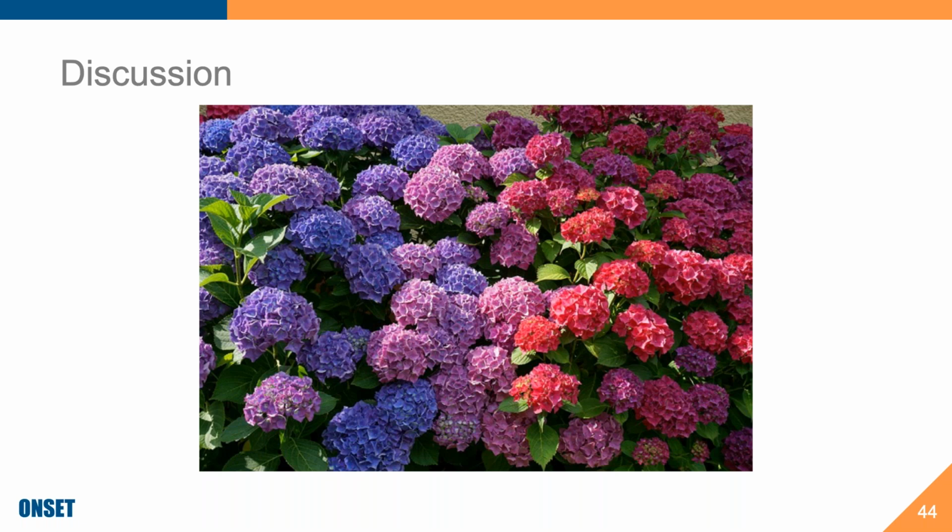What is your typical logging interval? Mine currently is at a 5-minute interval. The benefit of having a pH logger or multi-parameter sonde as opposed to grab samples is that, first of all, pH is diurnal very often, so you'll be able to see the diurnal changes in the pH of your body of water. But also, if you have an excursion in your pH during the interval between when you went out there for a grab sample, you won't know it happened, and you might miss something important in your environment.